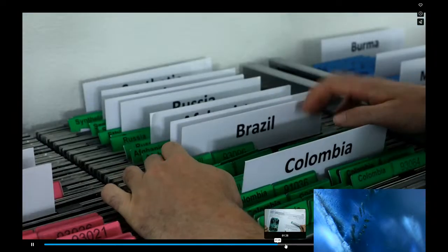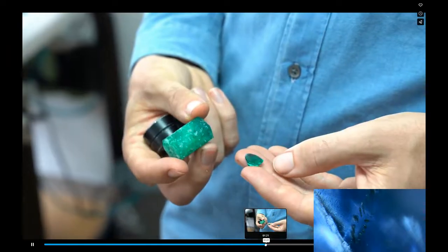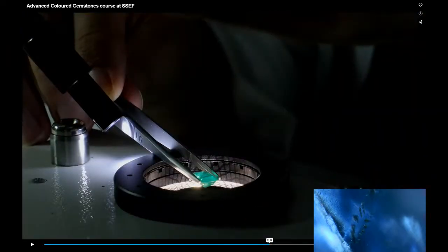You know what? Maybe I get a dark field illuminator. Like, if it really helps, because I've learned I don't really have dark field illumination, but this is pretty dope. This is pretty dope. I might get the ring as an additional, or maybe I just simplify it. Shouldn't be that difficult to get a dark field illumination onto my little microscope.